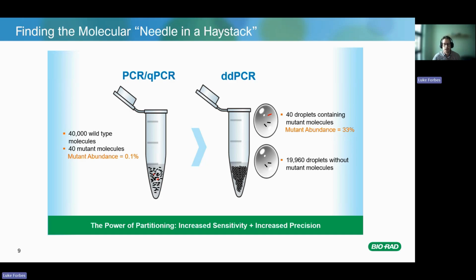Now, in ddPCR, you think of it like dividing that same lake into thousands of small ponds. You partition your sample into thousands of tiny droplets. Each droplet is then counted as it has DNA target or it doesn't, so it's a yes/no result. And you simply count how many ponds contain these fish, and then you don't need to compare between different lakes or different timings of the year, because the result is absolute. You know exactly how many fish are in the dam.